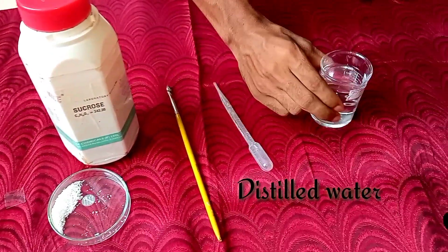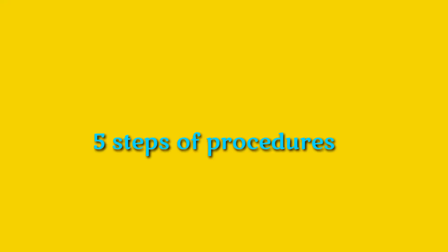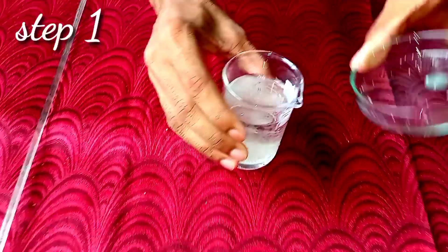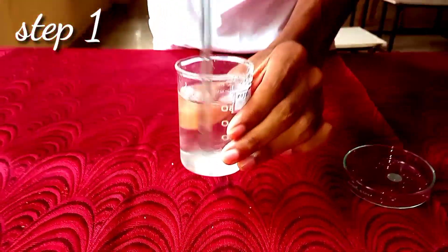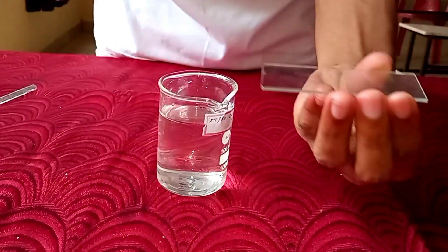Distilled water and a microscope. Now, five steps of procedures. Step number one: prepare a pollen germinating medium by dissolving 10 grams of sucrose in 100 ml of distilled water.